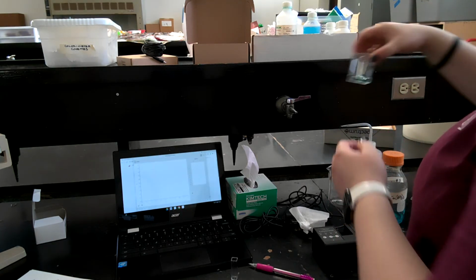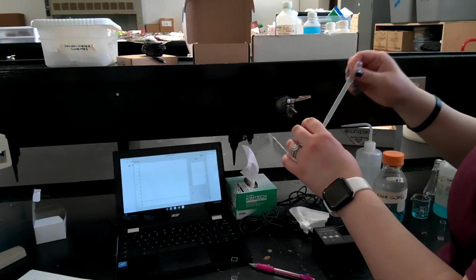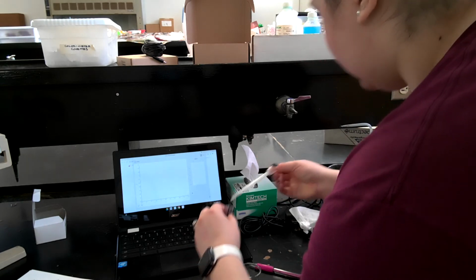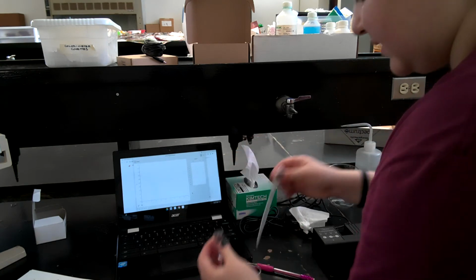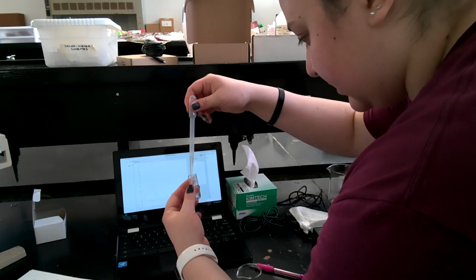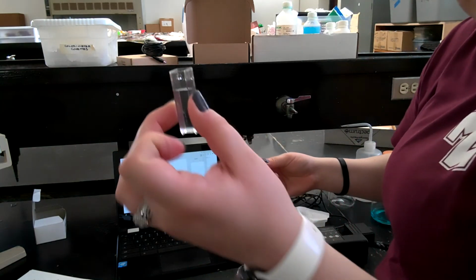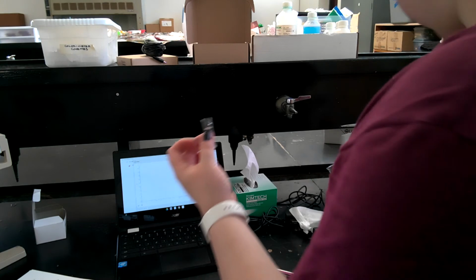So I'm going to start off with my most dilute, the one I showed you guys last. I'm going to rinse the cuvette and then dump it out, so that at least the sides have the same amount. And then I'm going to fill this about 3/4 of the way full. About this amount, for those of us who would like to see.